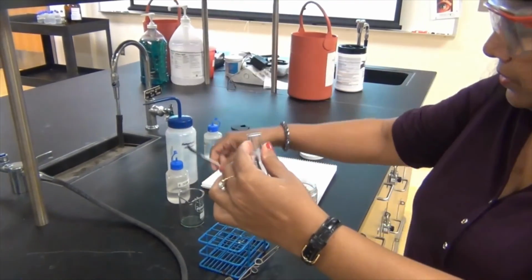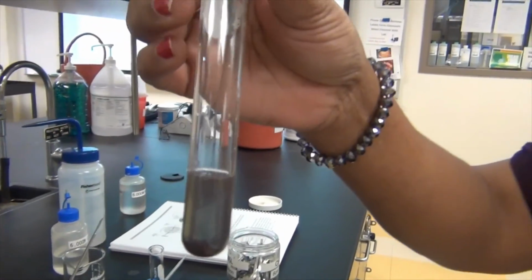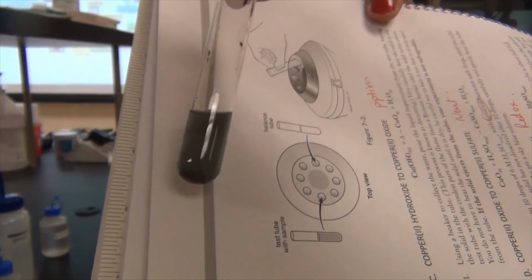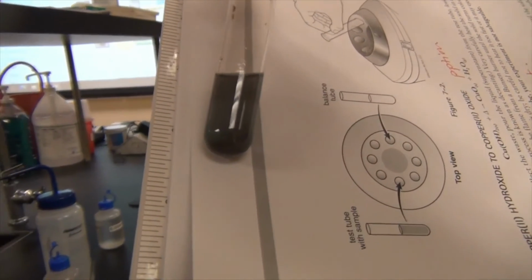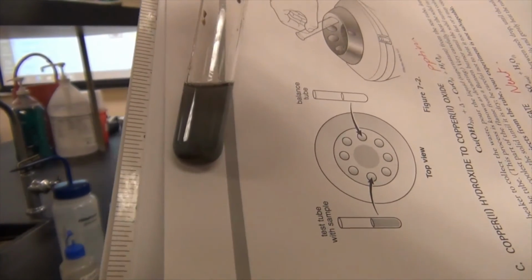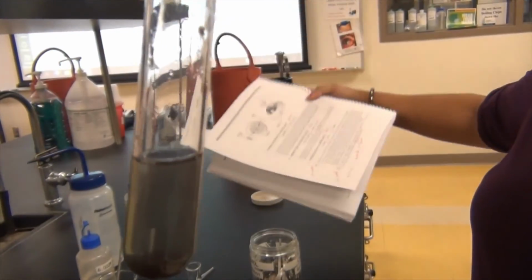I'm just going to leave it out of the reaction itself because what I would like you to see here, and let me put something white behind so you can see the color, is the color of the copper in there, because this is the copper that we got back. So think about the copper that we used before and then look at this copper that we have over here. See if you can recognize the color and write the color of this.